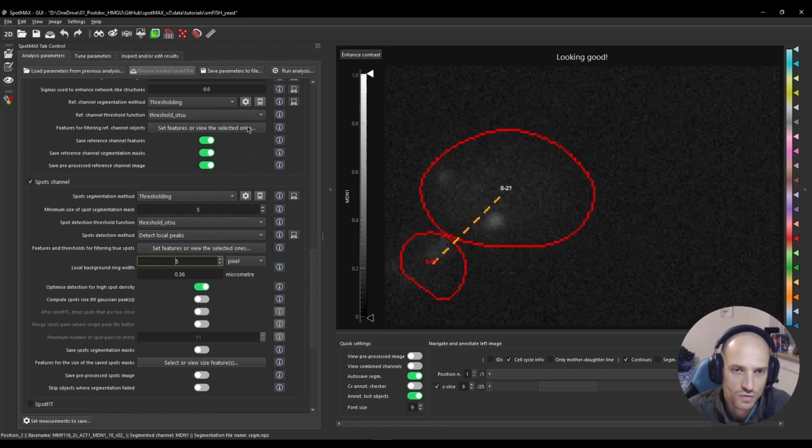So first you do all of your detection steps, see that you detect those spots, and once you have that, you can run one last run with compute spot size and get additional features like the spot size and other spot intensities. Basically, in this step it fits a Gaussian curve to the three-dimensional spot, a three-dimensional Gaussian function, where it can extract the diameter, the intensity, the volume. This is really good for knowing how much signal you have in each single spot and stuff like this. But I would do it only at the end.